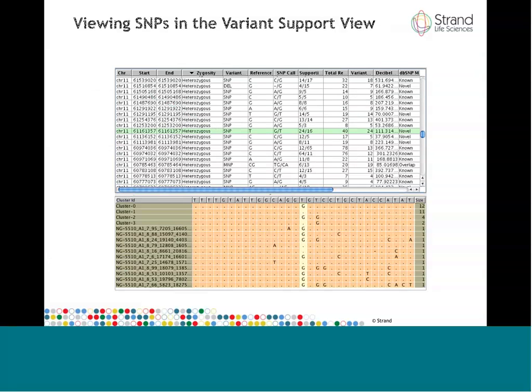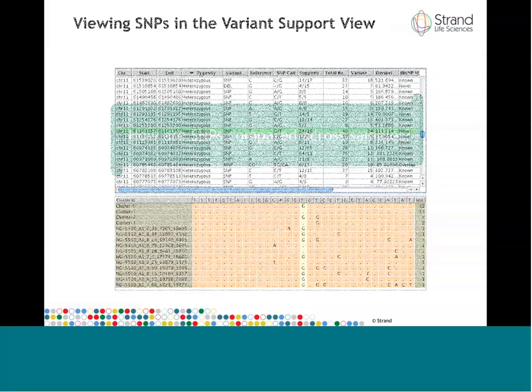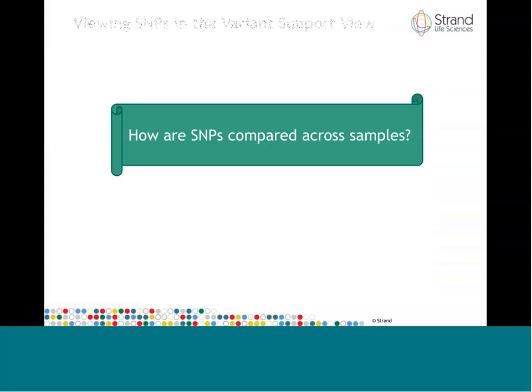So that's how SNPs are called. That's how SNPs can then be verified. Once you call your list of SNPs, you put it in the genome browser and the variant support view and verify and gain confidence that indeed the calls are correct. Once you've done that, you're ready to compare SNPs across samples.